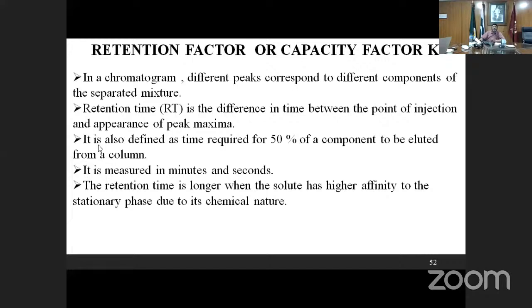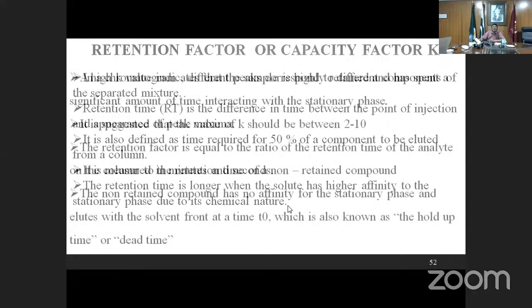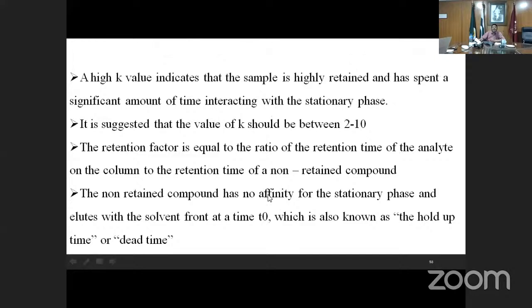It is also defined as the time required for 50% of a component to elute from the column. Again, I insist that 50% means 50% of the peak, not 50% of the analysis. It is measured in minutes or seconds. The retention time is longer when the solute has high affinity to the stationary phase due to its chemical nature. Then again, K factor, dead volume, all these terms we use now in analytical HPLC.